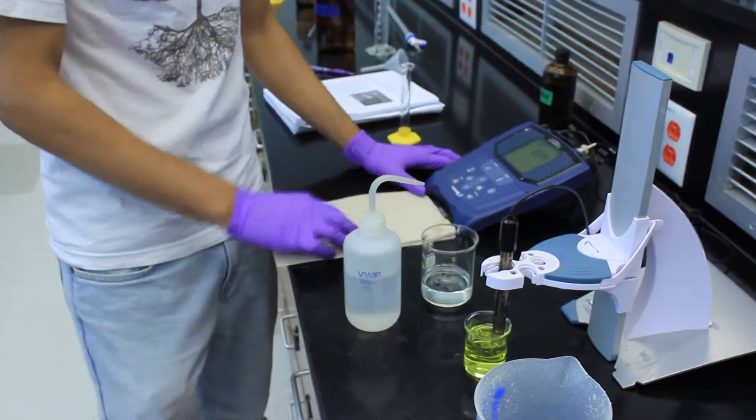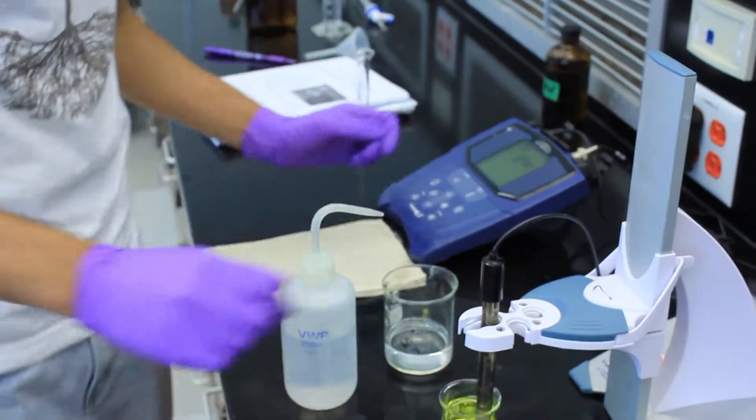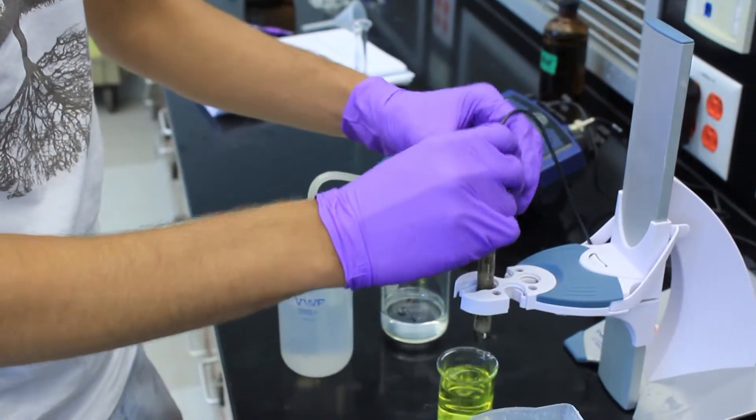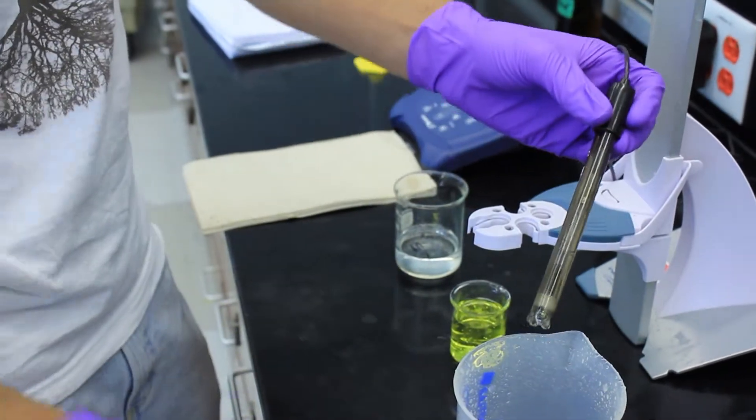There are two types of pH meters, the Symphony and the Denver. This is the Symphony. To measure with this pH meter, make sure the glass electrode is properly rinsed and dried. Be very careful because it can break really easily.